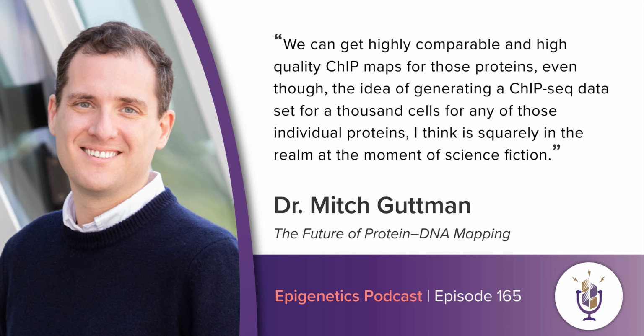There's an antibody crisis, if you will, in the biomedical sciences. We haven't solved that, and that's obviously something that we too are sensitive to. If there are certain proteins for which there are no high-quality antibodies, you can't, at the moment, do ChIP-dip on it. And that's a standard problem that we all unfortunately share. But there's a second, I think, unique aspect about quality that affects ChIP-dip that is different, and that is thinking about the pooling aspect.